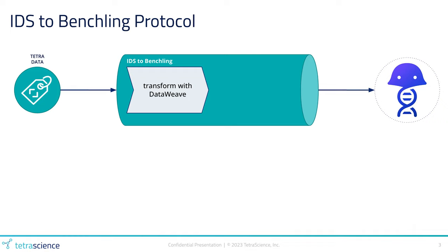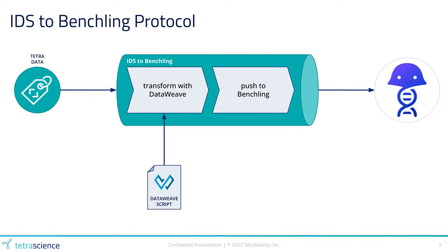This is done using the DataWeave transformation engine and has an associated script with the details about how the data is to be transformed. The second step is to push the transformed data to Benchling using their standard REST API endpoints.